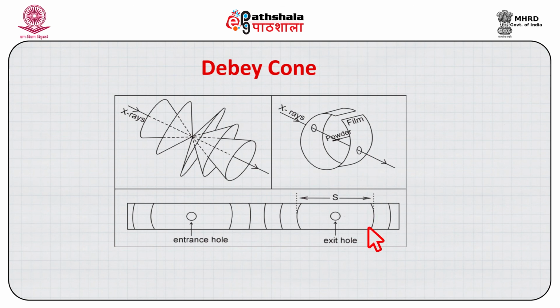But if there are intergrowths present, and minerals with complicated structures on account of impurities in their composition, that can lead to variation of this. But it does provide us an identification tool for minerals which cannot be identified otherwise.